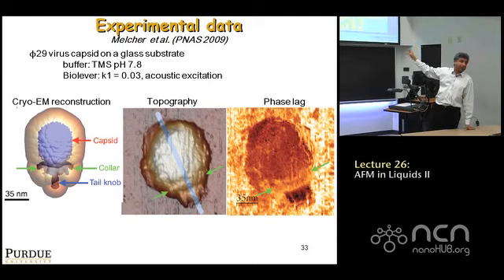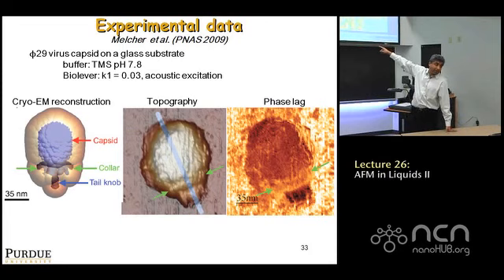That's the whole idea. If you don't do tip convolution, a cryo-EM reconstruction shows the following shape. But if you take that shape and you convolve it with a 5 nanometer radius thing, then that shape appears expanded in an AFM. So the true comparison that has to be made is really between a tip convoluted cryo-EM data bank image and what you get in an AFM. That's the whole point of that.